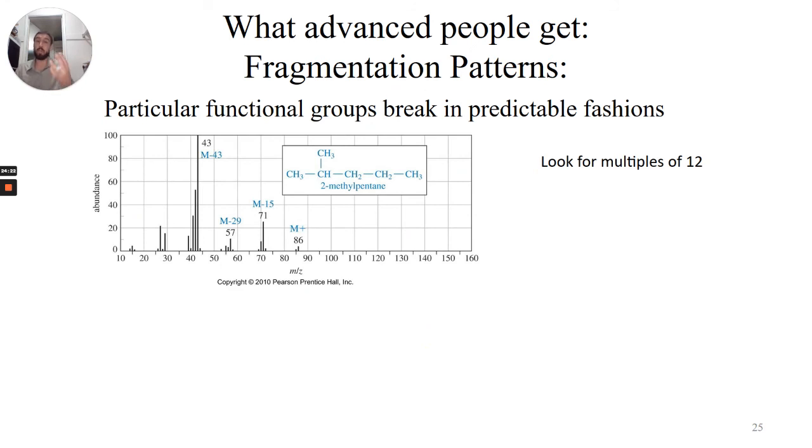So what does that mean when we look at a spectrum? Okay, so here's a mass spec. You'll notice that we're seeing that m/z, that mass to charge ratio. The abundance, our vertical axis, is normalized to 100. The instrument just counts however many things, and then says whichever one was the most, that's now 100. Everything is scaled according to that. Okay, so it's a normalization.